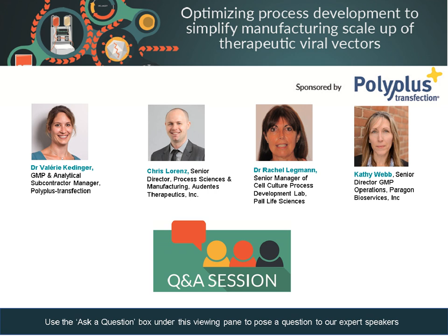Yeah, absolutely. And Alengo, following on from Rachel's comment there regarding complex size, and also looking at a question that's come in from our audience: what would you say is the right size of DNA to PEI complexes for optimal transfection?